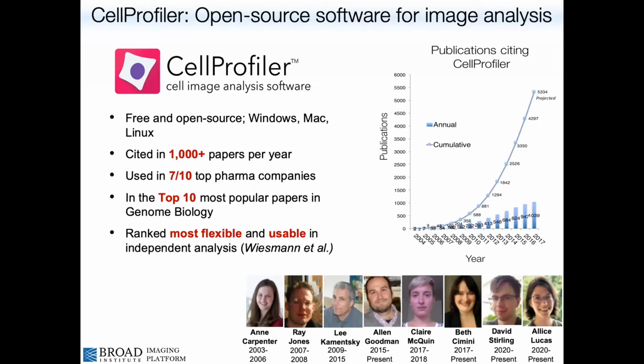This is our software engineering team, who have done a great job in making the software over the years, and making it the most flexible and user-friendly image analysis software for biological image analysis, designed specifically for biologists.